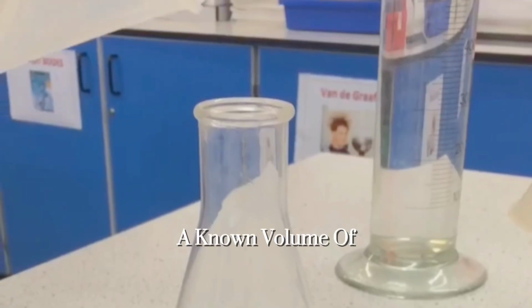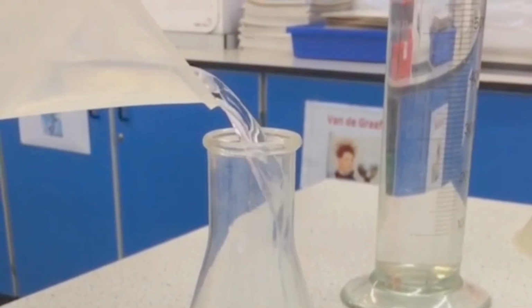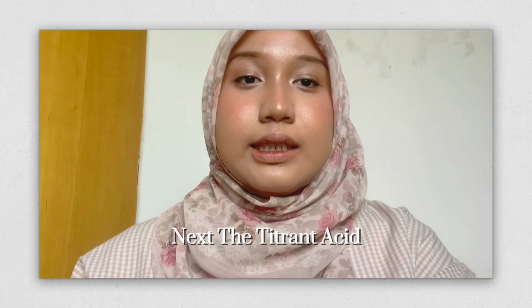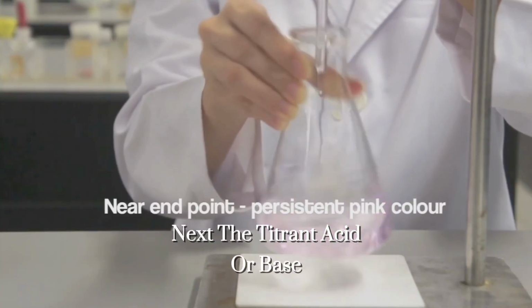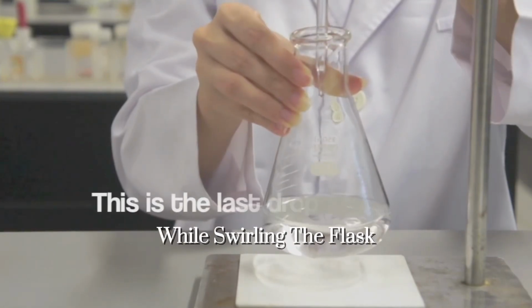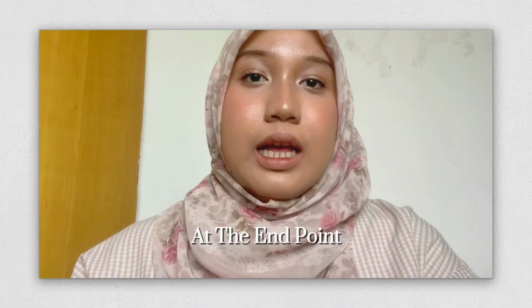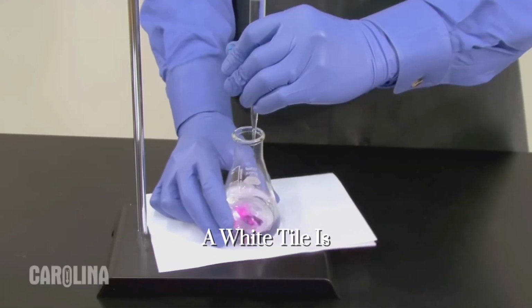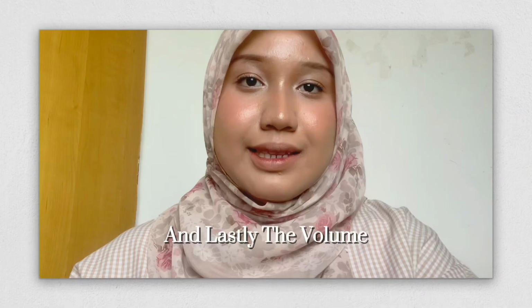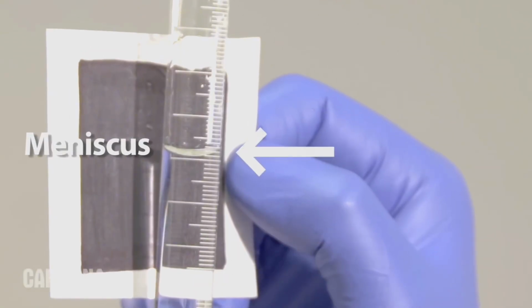Firstly, a known volume of the water sample is placed into a conical flask. Secondly, the indicator is added to the sample. Next, the titrant, acid or base, is slowly added from a burette while swirling the flask until a color change indicates the end point. In this experiment, a white tile is required to observe the color change clearly. And lastly, the volume of titrant used is measured.